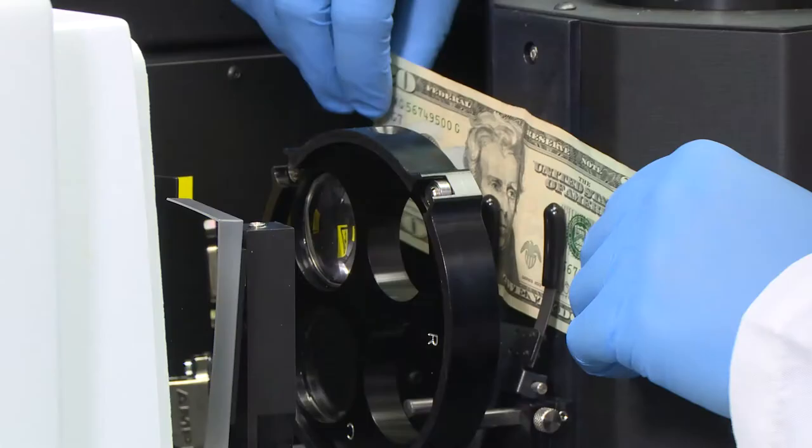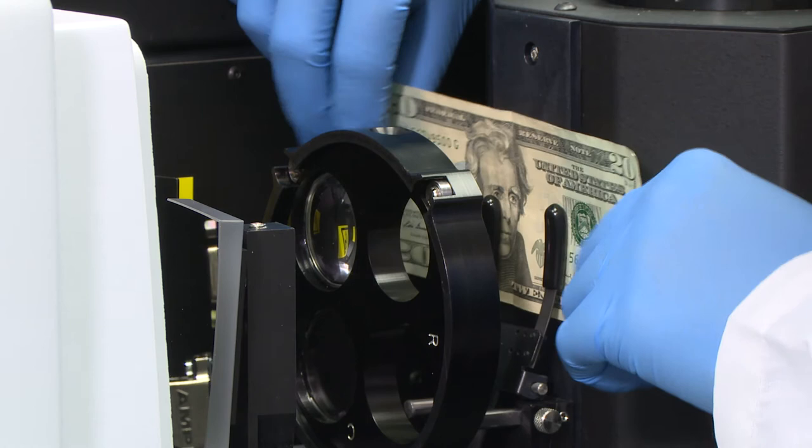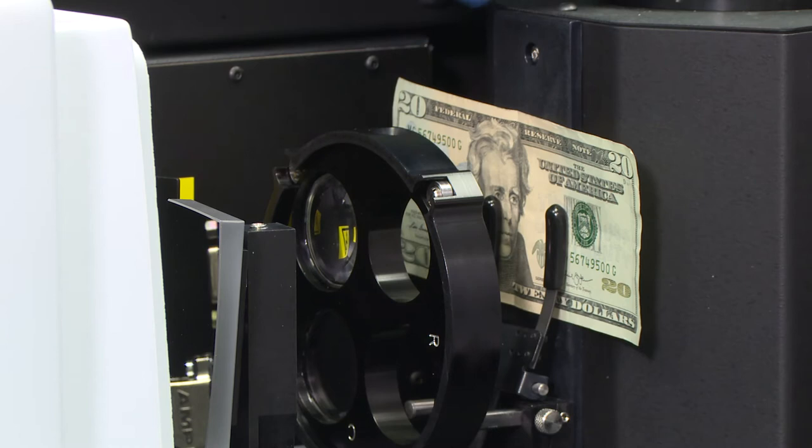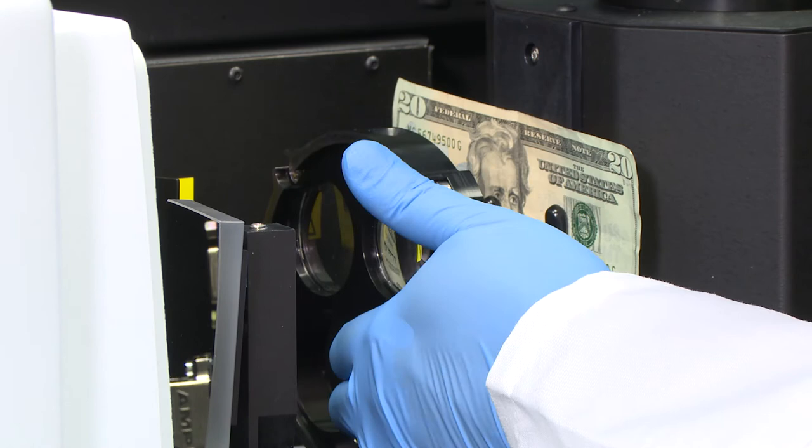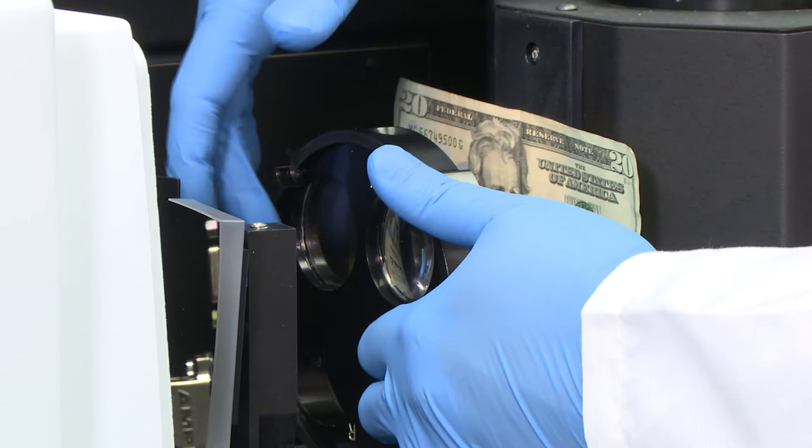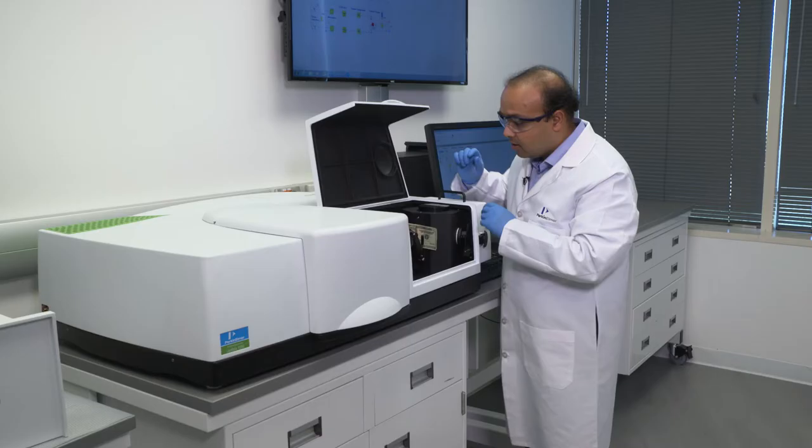Now in the next example, we'll position a $20 currency note that has different ink patterns on the surface here, and really show the importance of having a small spot accessory. Now this accessory has two different kinds of lenses, a transmission lens here that will focus the beam right on the transmitted port, and also a different reflectance lens that will focus the beam on the back port here.